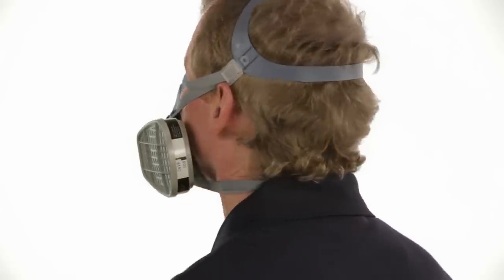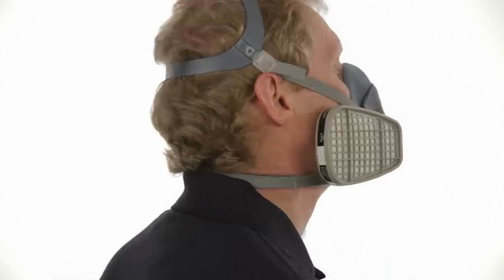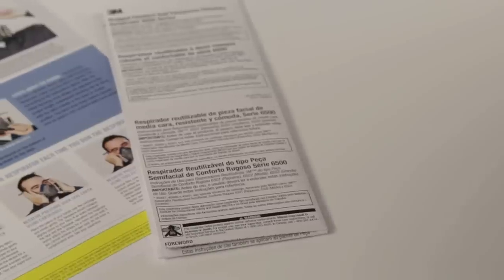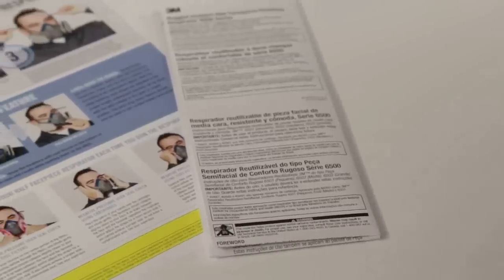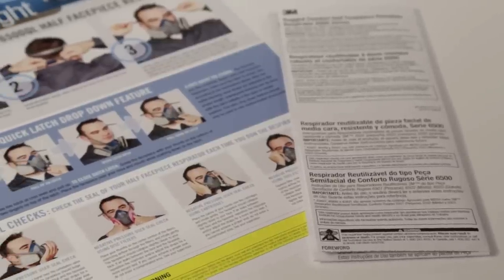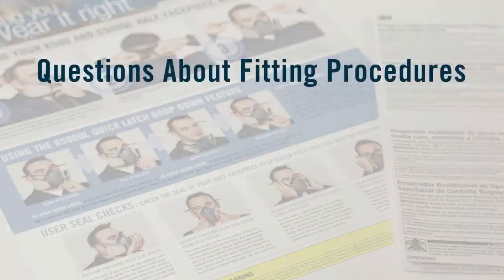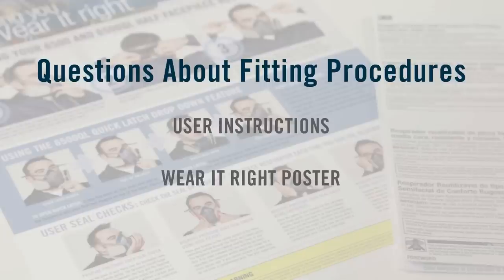Each time you wear a respirator, you must know the proper fitting procedures and follow them carefully. Today, we will introduce you to the half-face-piece respirators made by 3M and provide training on how to both use and obtain optimal performance from your 3M respirator. If you still have questions about correct fitting procedures after viewing the appropriate segment for your respirator, review the information provided in the user instructions. Check the steps on the poster provided by 3M or see your supervisor.